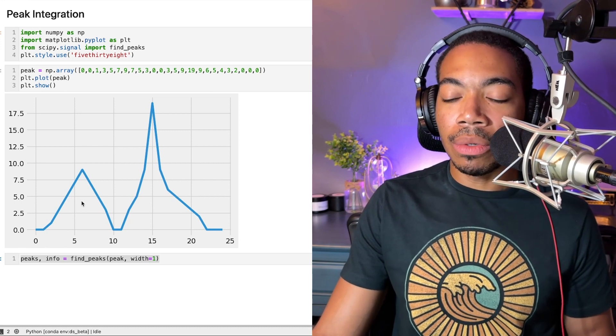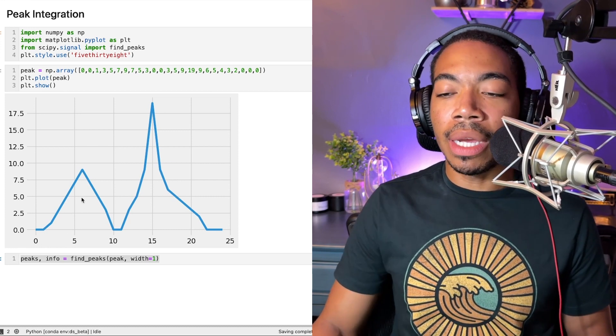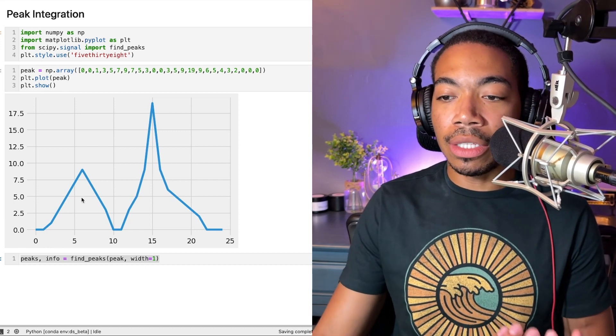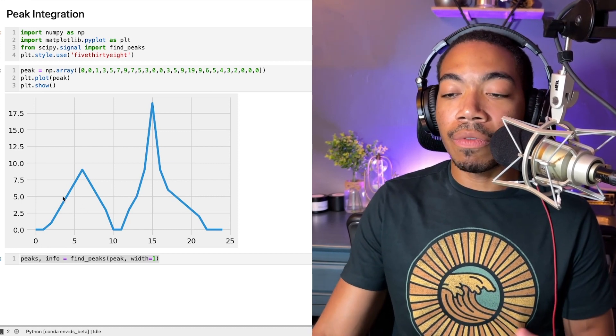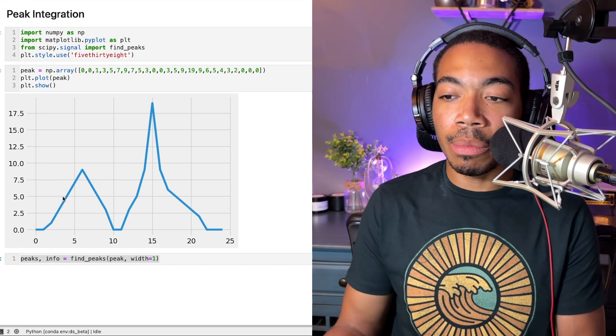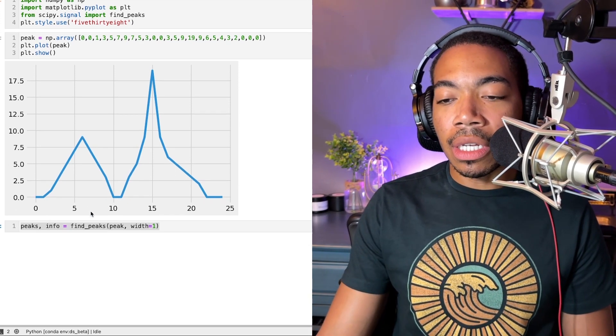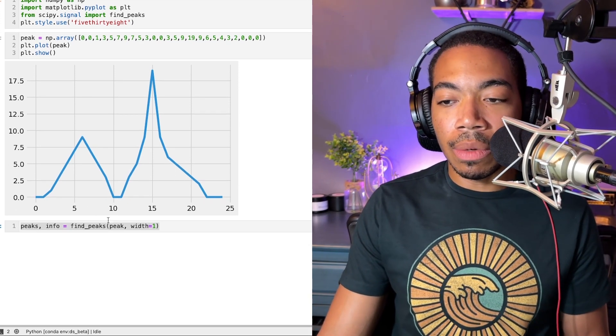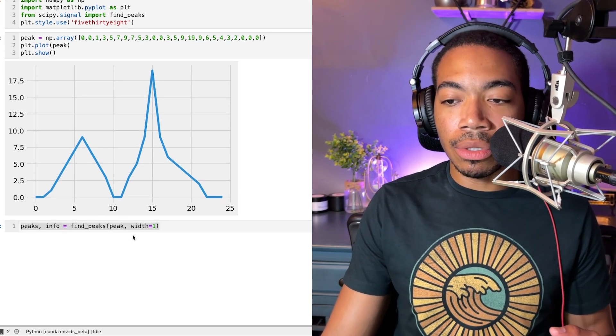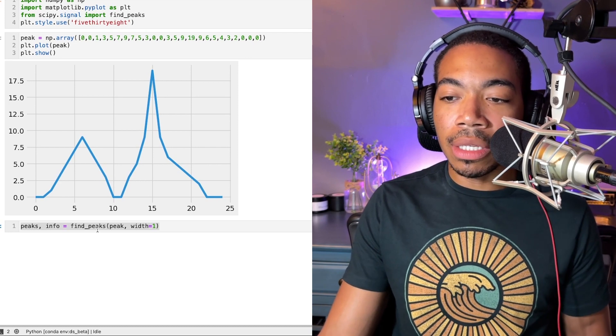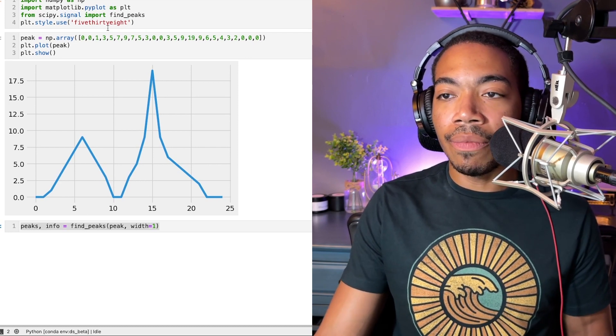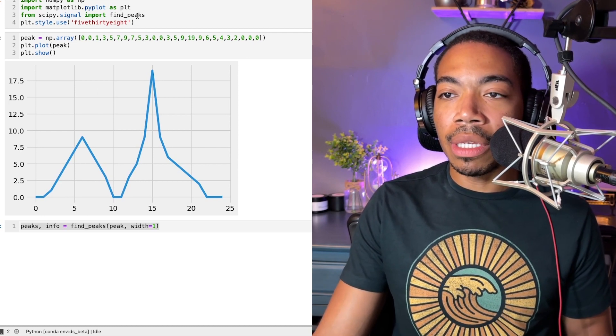Now I want to build a way to integrate these two peaks—first identify where the peaks are and then integrate them. We've already done the first part, in which we know how to find peaks using the find peaks method from the scipy.signal module.